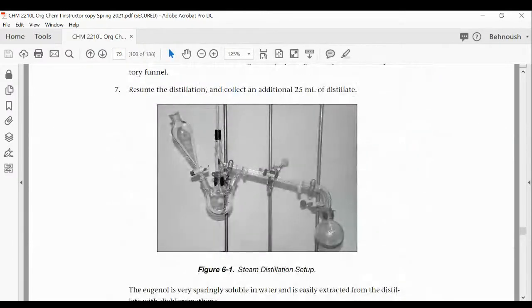And the minor difference is, you see that here you are using a 3-neck boiling flask. In a simple distillation, you just use a simple boiling flask. The reason we are using the 3-neck one is because we want to make sure that we have enough water in reservoir without filling the flask all the way to the top.